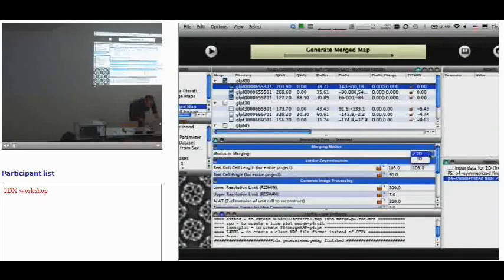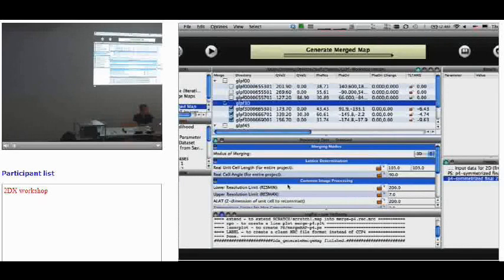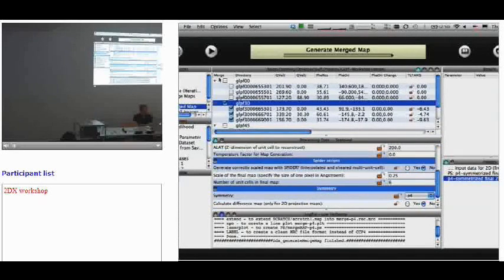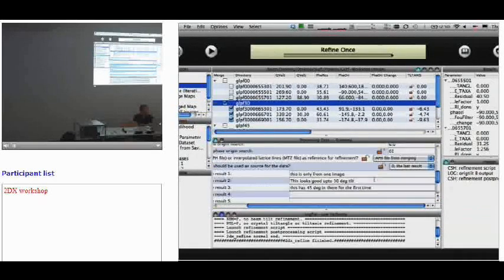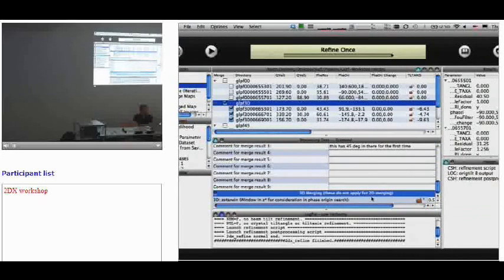So in order to switch this to 3D mode, I put this to 3D. And then we now have a merged data set here. I don't use the non-tilted, and I use the 30-degree tilted pictures. And I think my Z-star range is still, where's this? So my Z-star range is still at a large value, 0.5. That's large enough. Yeah. This is the Z-star window.